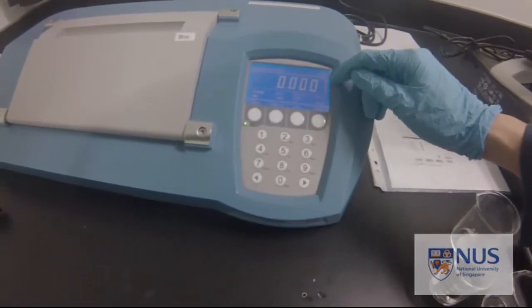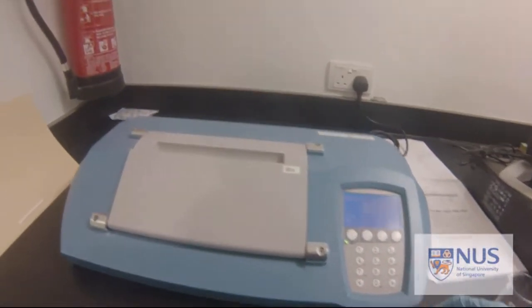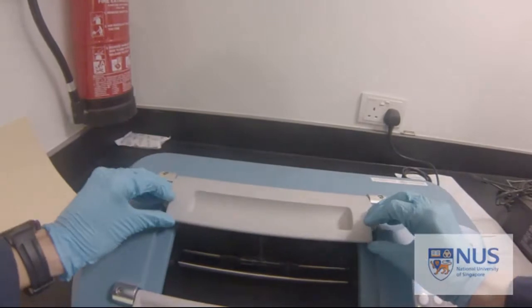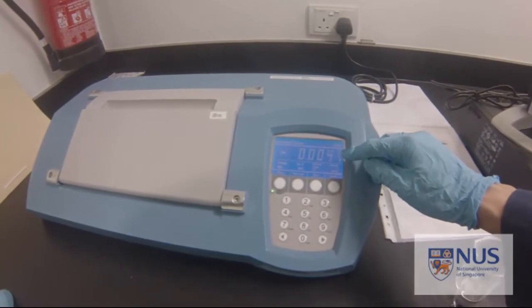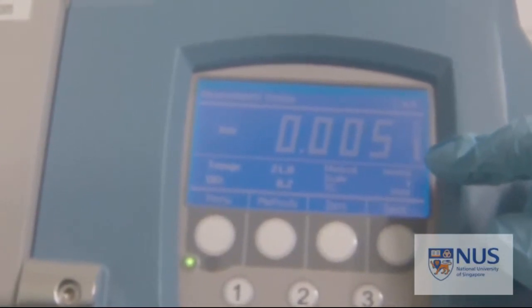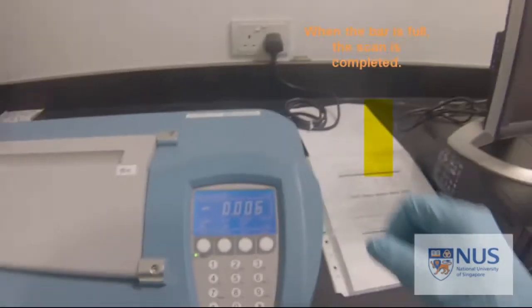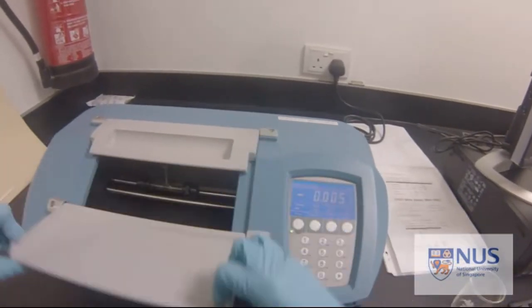Over here is a scale where you see the reading and whether your reading is ready. Next step: open the lid, open the window, and place the sample cell inside. Close the lid and you'll see a reading being produced. The bar is not full yet — you have to wait until it reaches the maximum. It is scanning. Now it's completed. The reading shows this number, but since it's supposed to be empty, it should show zero.